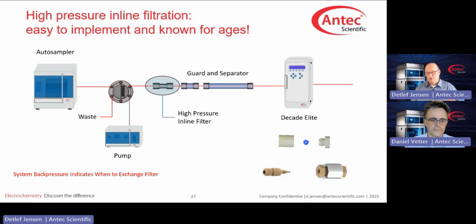Now you might say, Detlef, wait a second. I don't want to stop and exchange and restart. And there are things then consequently that I have to do, like recalibration or checking the calibration. Can't I automate these inline filtration steps? And the answer is yes.